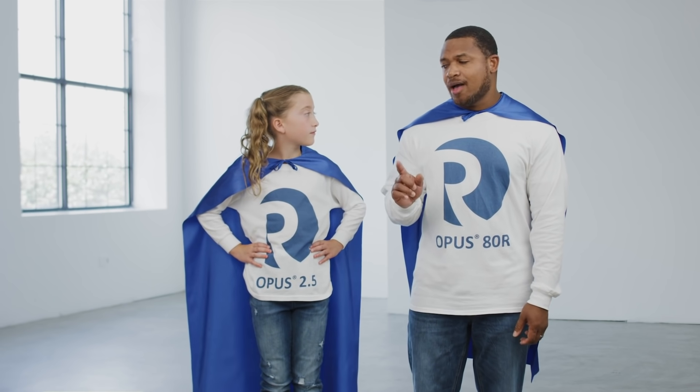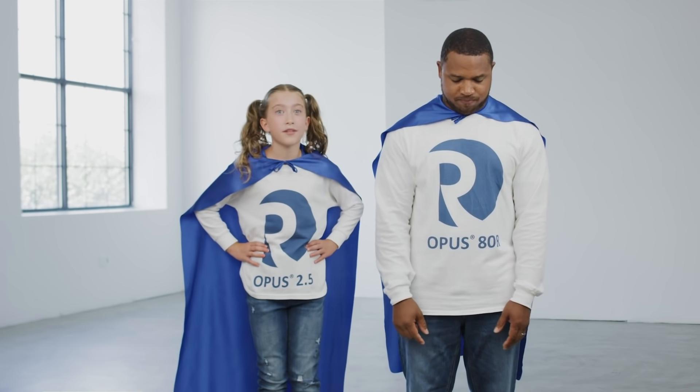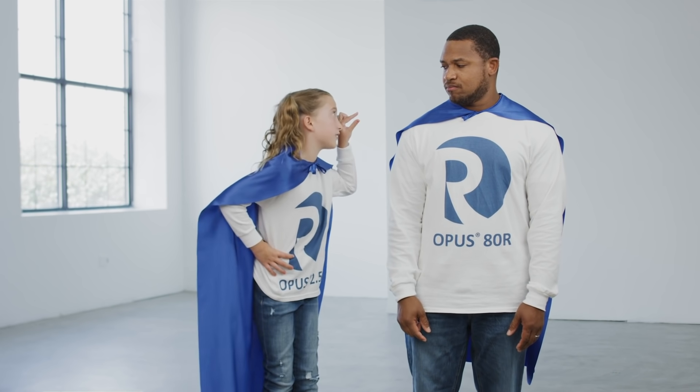With the Opus 80R, the bed height can be defined to the nearest millimeter. With the Opus 2.5, the bed height also can be defined to the nearest millimeter.